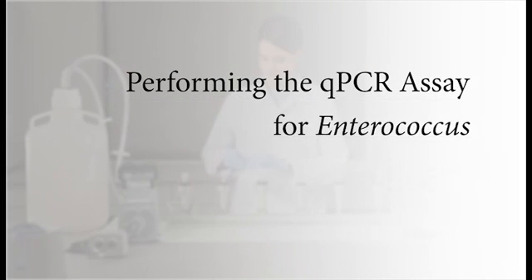Performing the qPCR assay for enterococcus. For training purposes, the procedure has been broken up into seven steps.